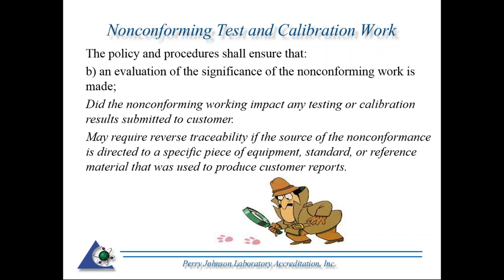Hence, reverse traceability would be every artifact or sample where that weight or pipette was used to produce your customer's calibration or test reports would need to be looked at. And the significance of the nonconformance, did it actually impact the results that were submitted, would need to be looked at and evaluated.